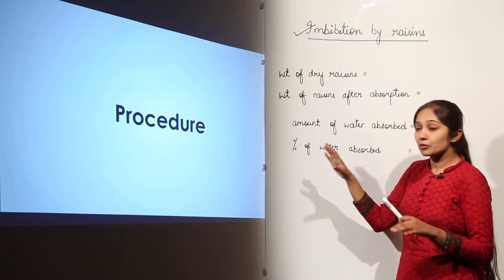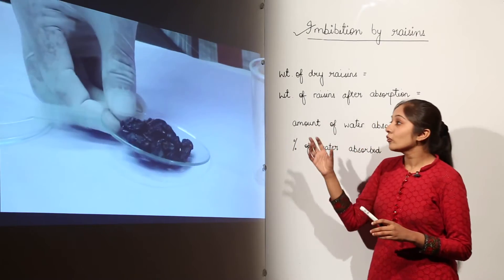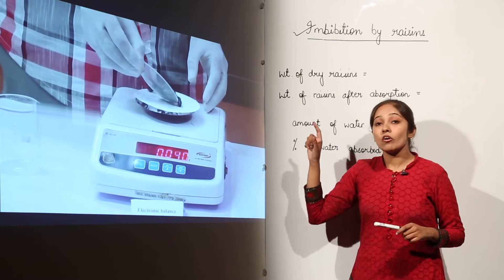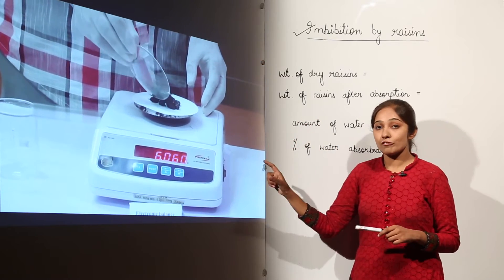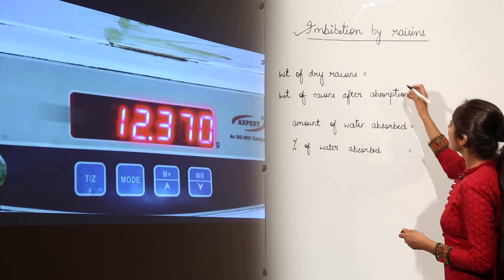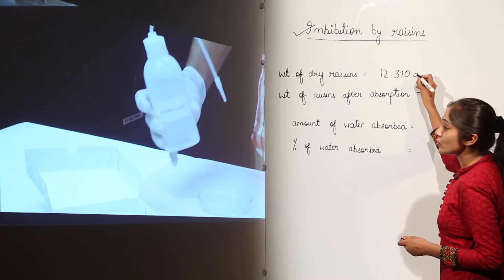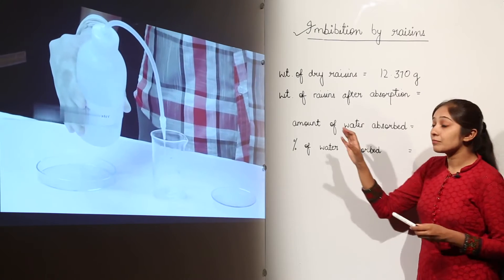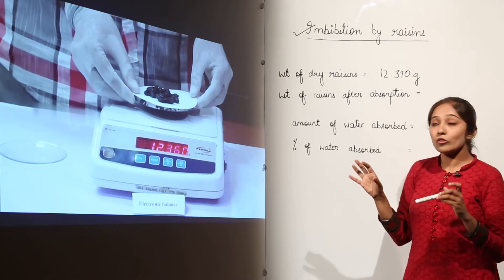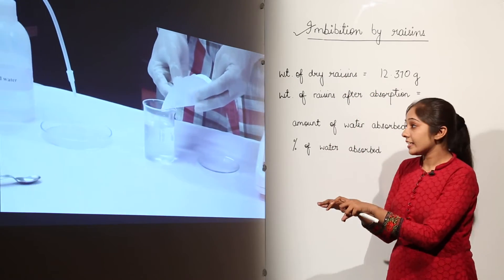For the procedure, take the raisins with intact stalks and weigh them on a weighing balance. The weight of the dry raisins — before putting them into water — comes out to be 12.370 grams. Now add some distilled water to the beaker and place the dry raisins into the beaker containing water.